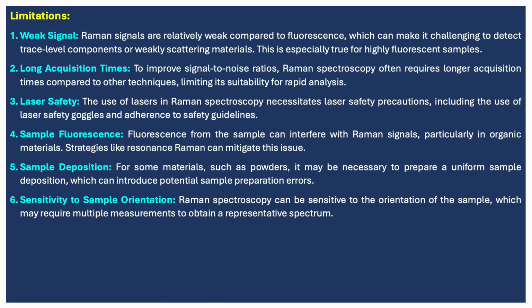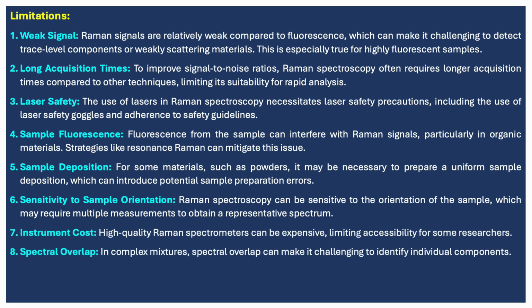Then in the sixth point I have mentioned that Raman spectroscopy can be sensitive to the orientation of the sample, which may require multiple measurements to obtain a representative spectrum. Regarding instrumental cost, high quality Raman spectrometers can be expensive, limiting accessibility for some researchers.